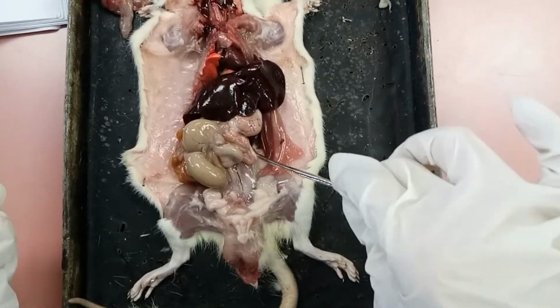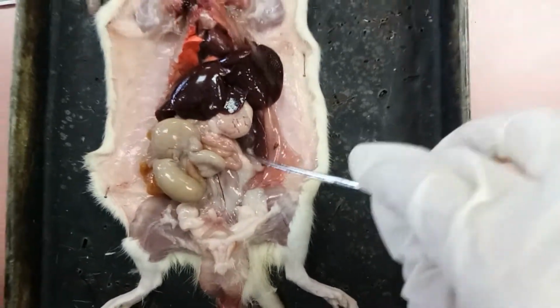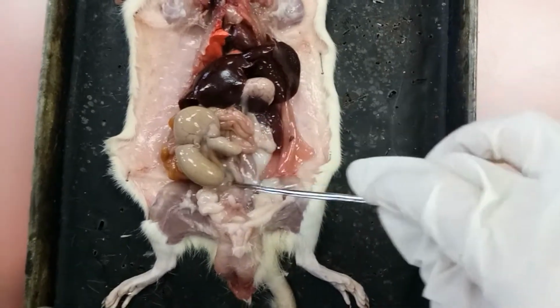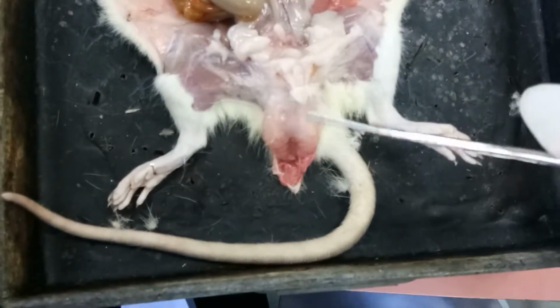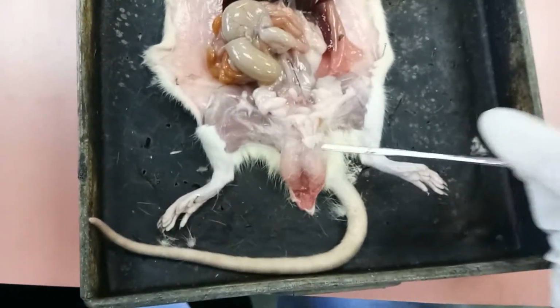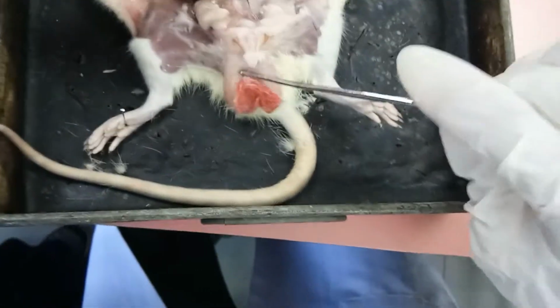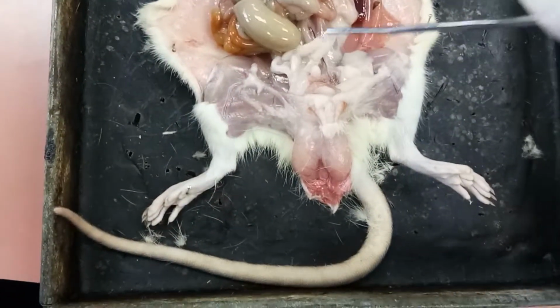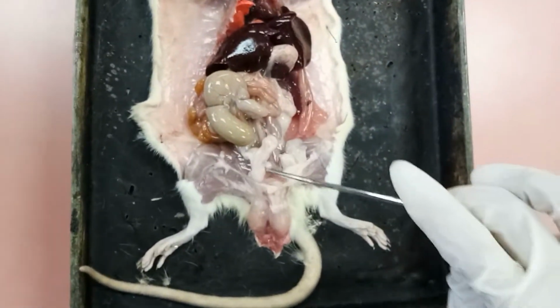Where's the kidney? Kidney here, right? Yes, there, you can see. Kidney. And this is the testis, and this is the scrotum. What is this? The white duct. Ureter.